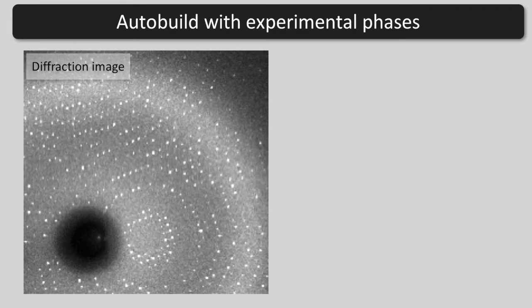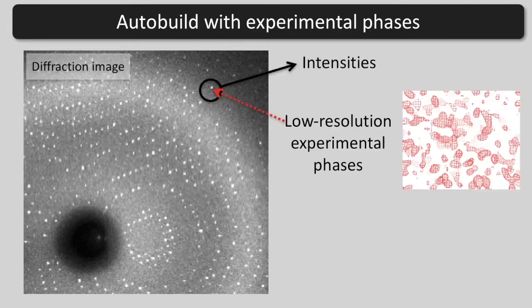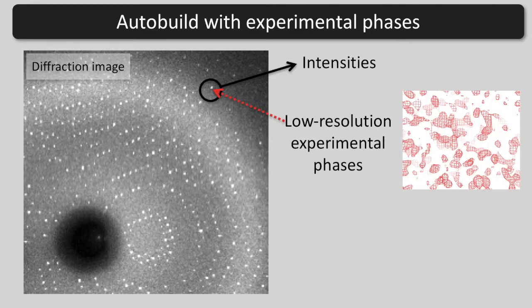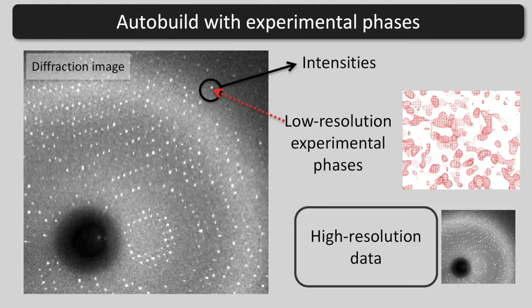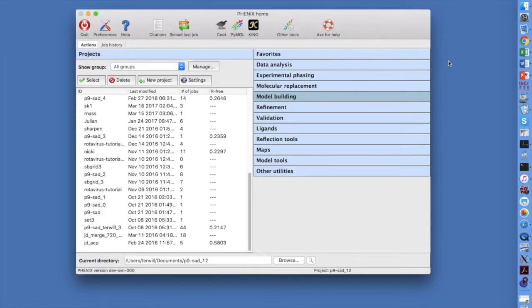Let's carry out automatic model building starting from measured intensities and low resolution experimental phases such as you might get from Autosol and a high resolution file for phase extension and refinement. Let's use demo data from the Phoenix tutorials.